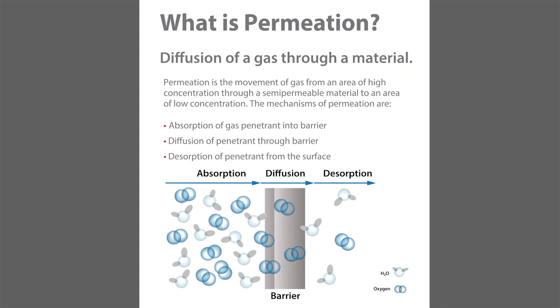soft drink. You've got your bottle, your PET bottle. It's nice and taut. A lot of CO2 inside the bottle, whereas in atmosphere, there's not as much. So what happens over time is the CO2 will diffuse through the bottle wall, and over time, you'll lose fizziness in your soda. And a lot of people think that it's leaking out the closure, which really isn't the case.